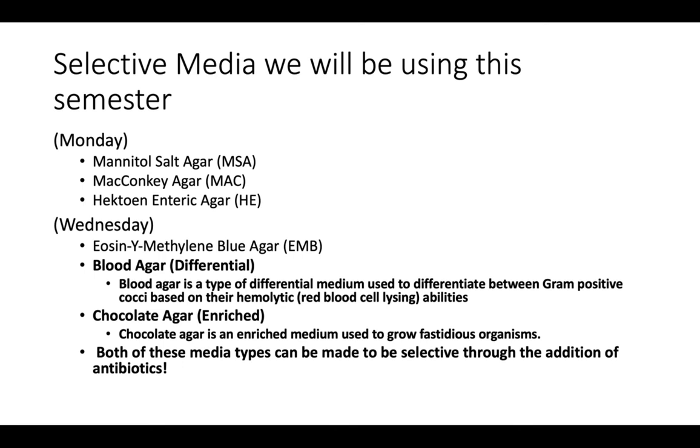We won't be using chocolate agar because we don't have that. So we will have demo plates for you that show you, in theory, how the chocolate agar should work. We are still going to talk about chocolate agar, so you still have to know this stuff for your exam and your quiz. So don't tune out when we get to chocolate agar.